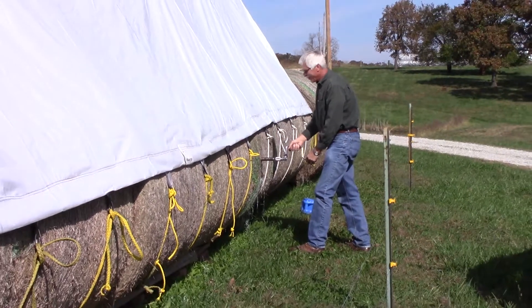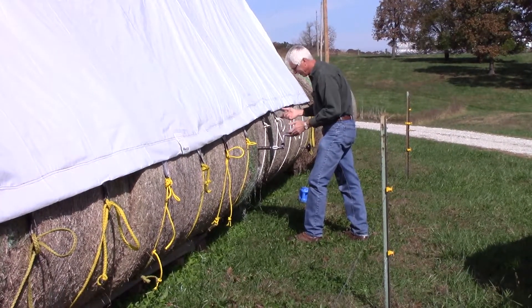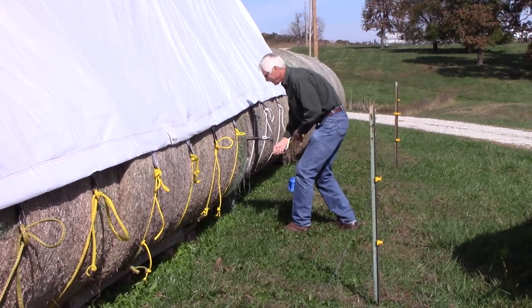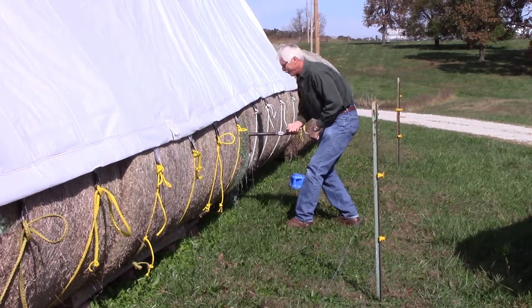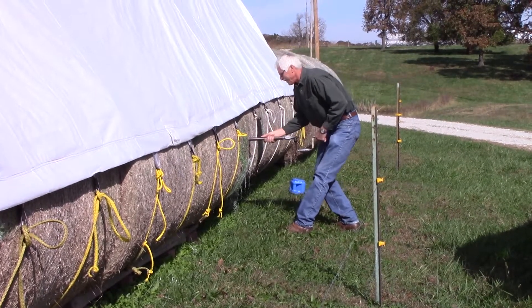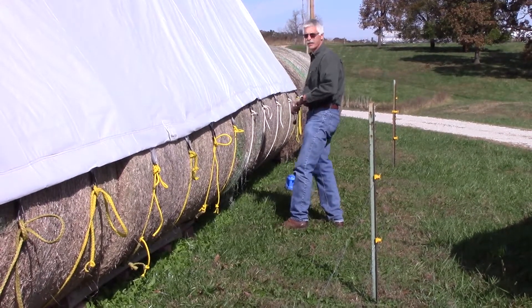Some bales are harder to core than others, and sometimes you'll hit a spot that's very hard to get through. Go in as far as you can and then pull out. That's why it's important to sample a variety of bales so you get a good cross section of the hay that's in all of them.